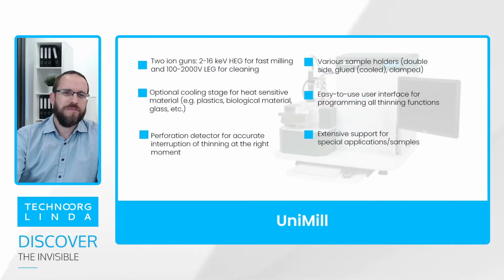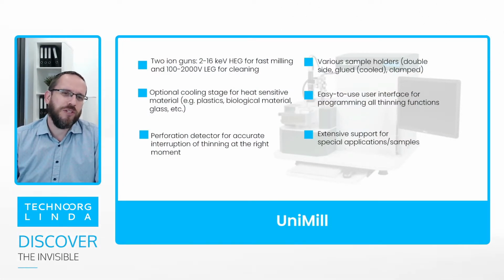Sorry for interrupting. Yeah, thank you for this addition. Let's go on and look at Unimill in a bit more detail and how to use it.